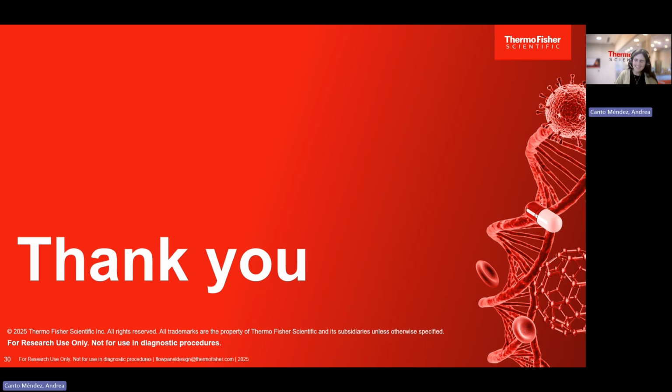Yes, absolutely. Thank you so much for the question. Actually, this was one of the focus areas that we wanted to highlight today. As we mentioned before, we might get circumstances where antibodies might not be the best approach. Maybe there is no good antibody in the market, or it doesn't have enough sensitivity to detect our target.